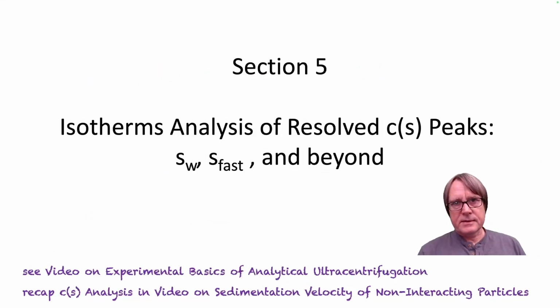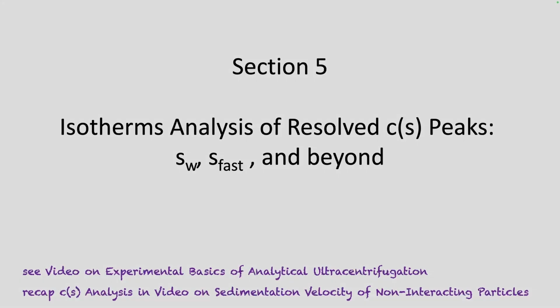So in the next section, we'll talk more about how to apply this in practice. And this will assume that you are very familiar with how to set up sedimentation velocity runs in the AUC, including the use of different optical systems and their detection limits. And likewise, we assume that you are very comfortable in carrying out basic c(S) analysis.